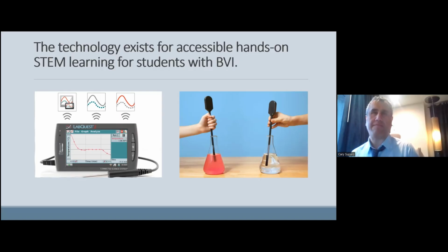you can also do it totally non-visually with the SALS sensor. Well, I mention this now because after more than a decade of working with the American Printing House for the Blind, they have made the SALS commercially available to anyone who wants one. And it uses a mobile application called the SALS, for an iPhone or an Android app, and then all of the audio tone outputs that you detect. So it uses the light sensor that's submersible in a test tube or a beaker or flask. And then it uses ambient light, and it converts ambient light to audible tone.